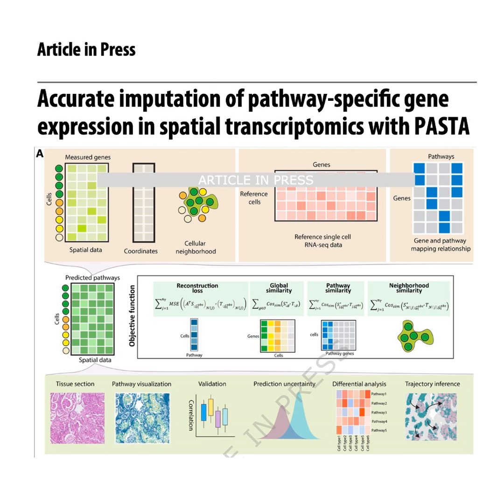If you're trying to understand biology at the cutting edge, you really need to know about spatial transcriptomics, or ST. This technology was named Method of the Year 2020, and for very good reason. It's fundamentally changed how we study cells. It gets at one of biology's oldest problems, context.